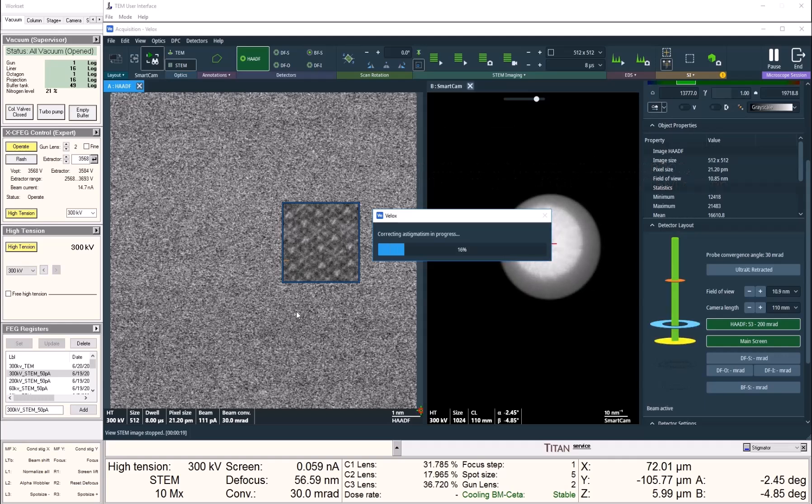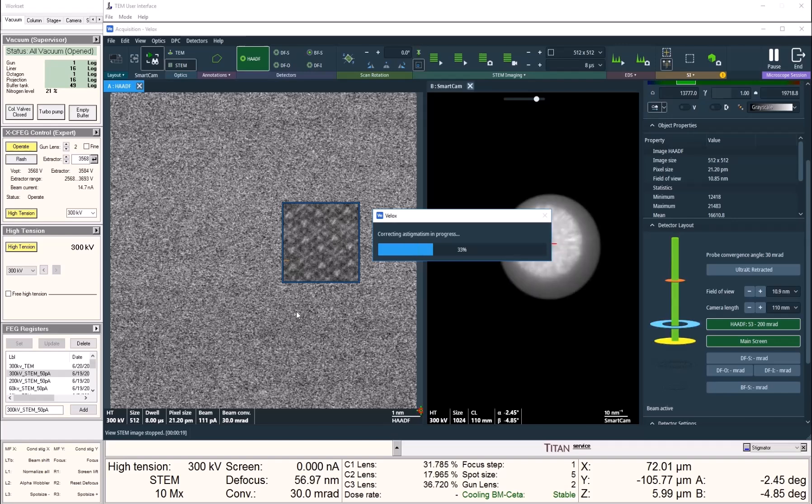In a few seconds, it returns me a cleanly tuned image resolving the atomic columns nicely.